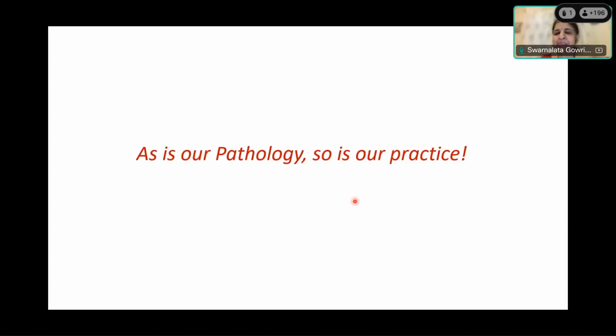There's one more question, ma'am. In fixation of postmortem specimens, are the concentration of fixative and duration of fixation the same as usual? Absolutely. I don't see any reason why postmortems need to be fixed differently. It's a large specimen. So again, you have to slice it and put it in adequate formalin, 10 times the volume, slice tissue 5 millimeters apart, keep it overnight for fixation, and then you can cross it. I don't think it's any different from your regular surgical samples.